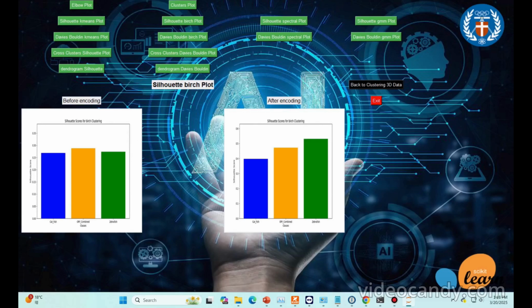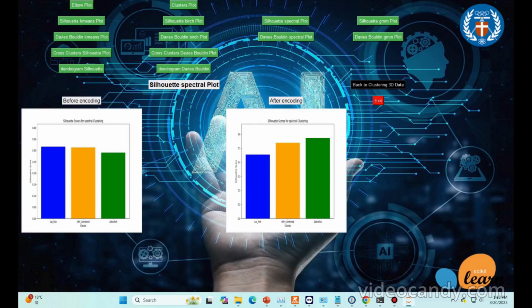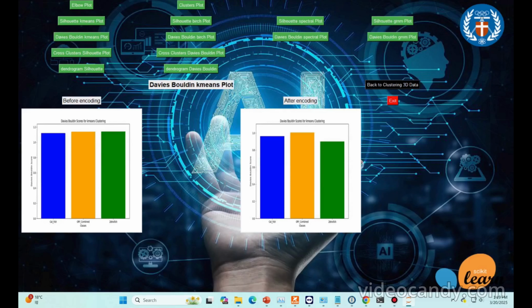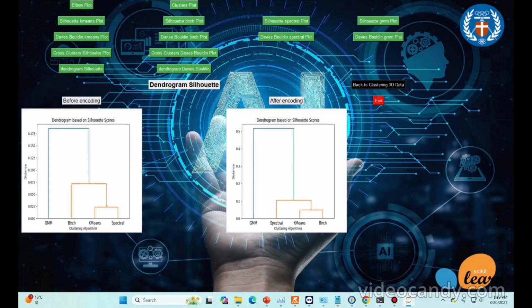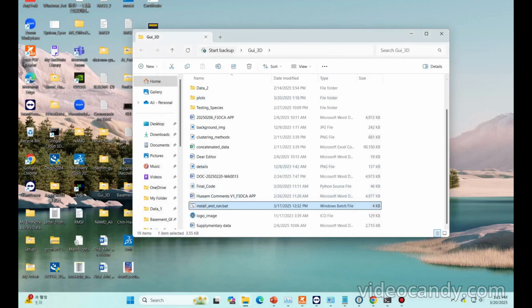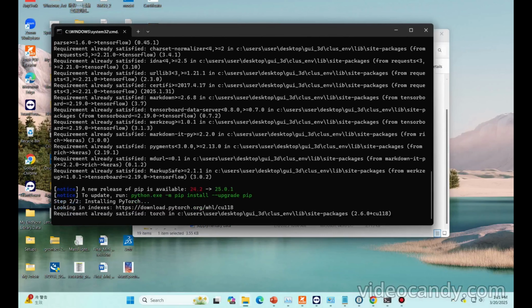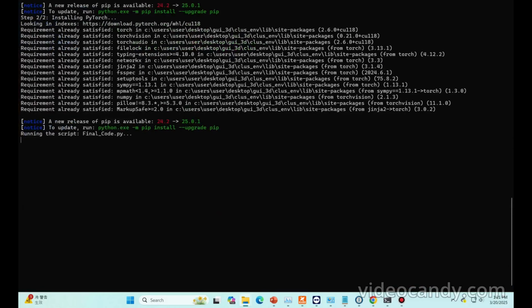We apply deep learning to enhance the scoring functions for the two statistical methods commonly used in clustering, the Silhouette score and the Davies-Bouldin index. Based on this you can see the separation power, and also the most comparative or related values for the locomotion behavior, which one is more similar and which one is farther apart, and also the dendrogram to see how the correlation between the indices is working.